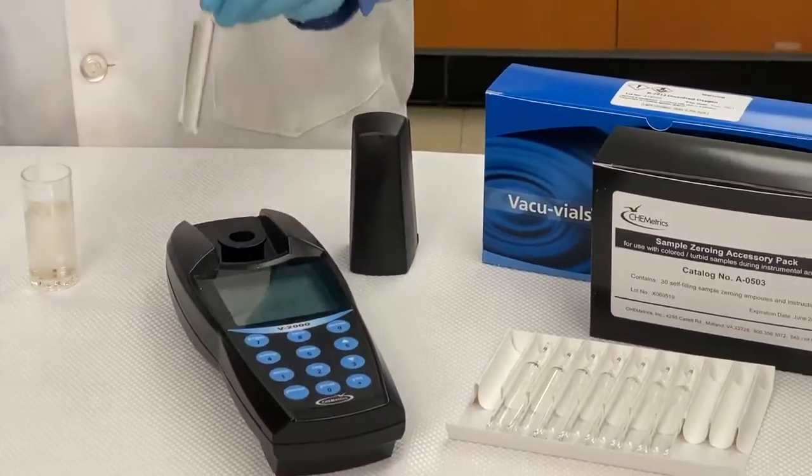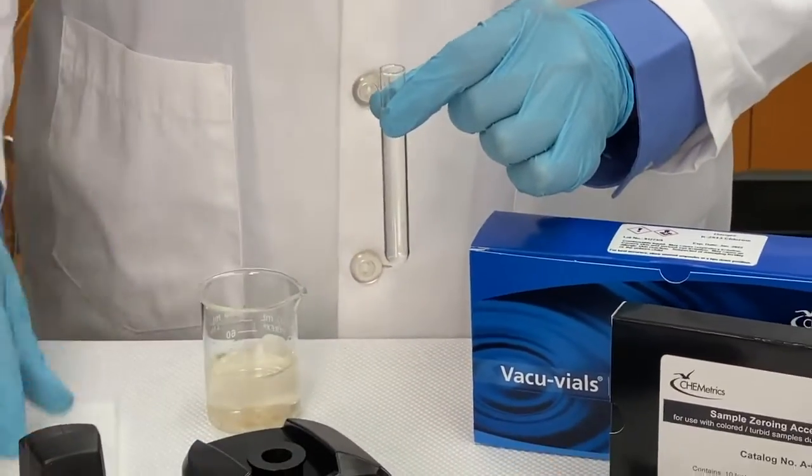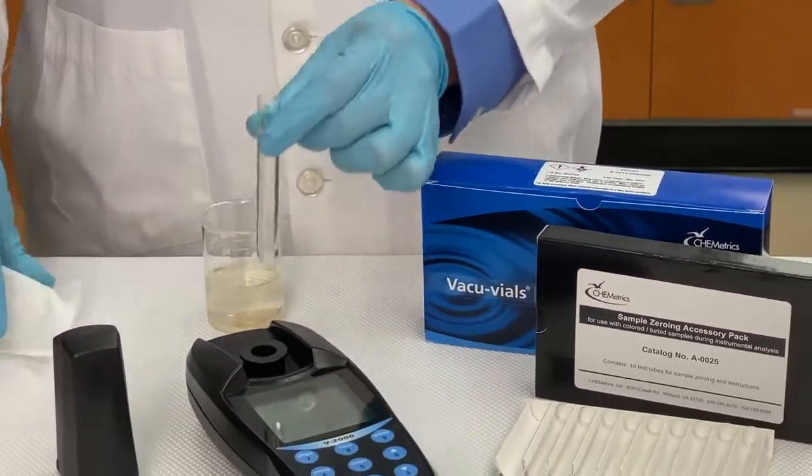To set your zero, you can either snap a self-filling zeroing ampoule in your sample, or you can pour your sample into a test tube. It's that simple.